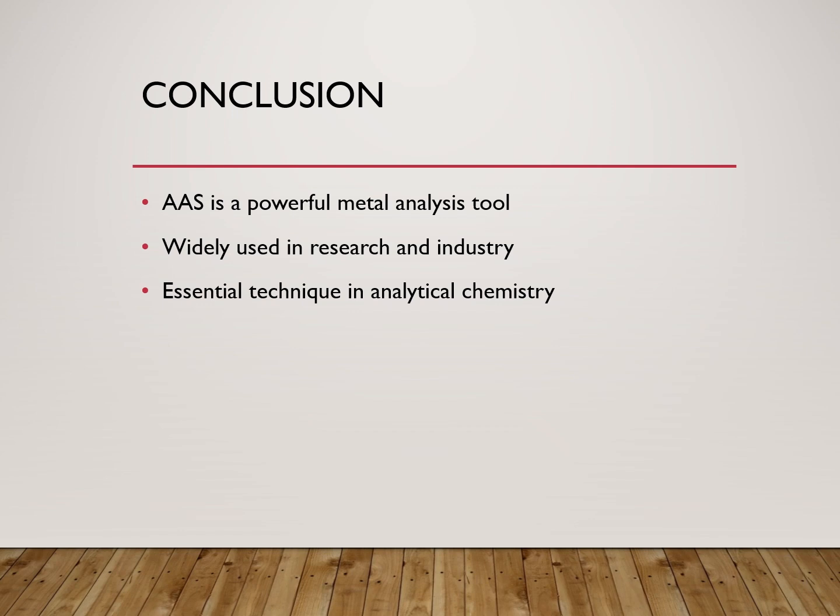Atomic absorption spectroscopy is a highly reliable and widely used analytical technique for metal analysis. Its simplicity, sensitivity and accuracy make it an essential tool in modern analytical chemistry.